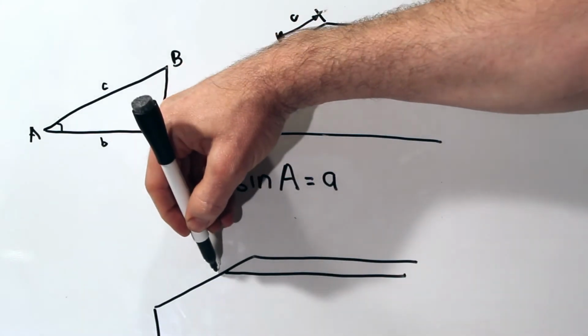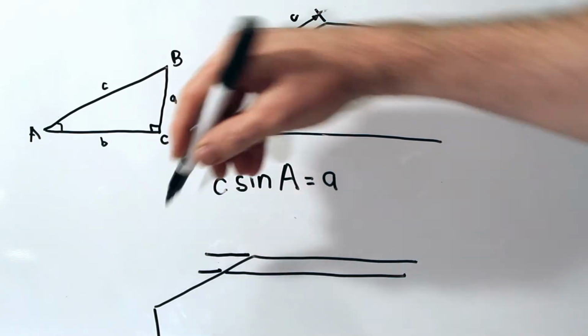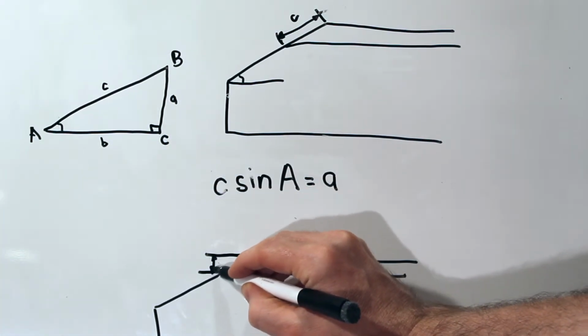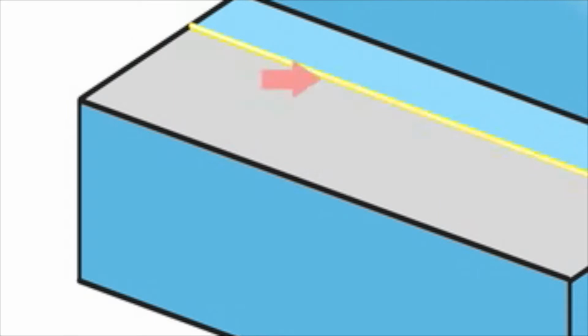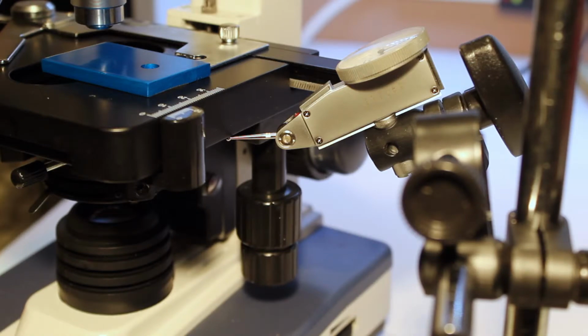The method I came up with that worked was to use the focal planes of my microscope and a dial indicator. I don't know why I thought I would use this project to learn how to animate with Photoshop, but here's what I came up with to illustrate the idea. Here is the setup in real life.